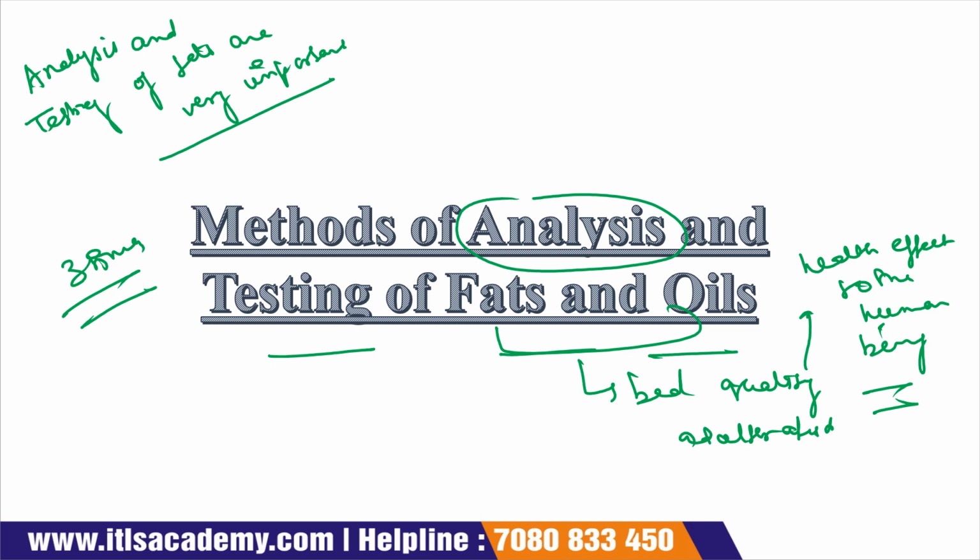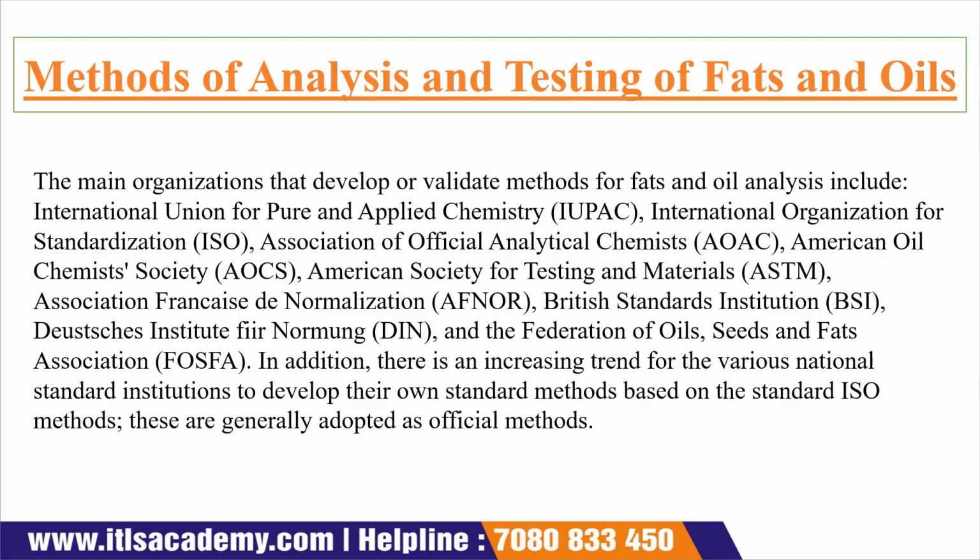So in today's lecture, we are going to discuss the different methods of analysis for fats and oil, and even the testing for fats and oil. So let's start today's lecture. Method of analysis of fats and oil.